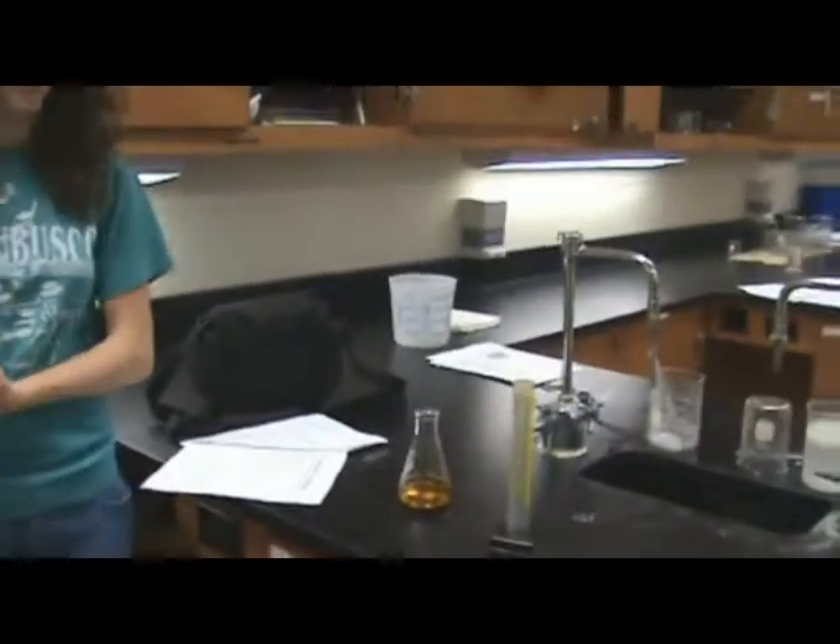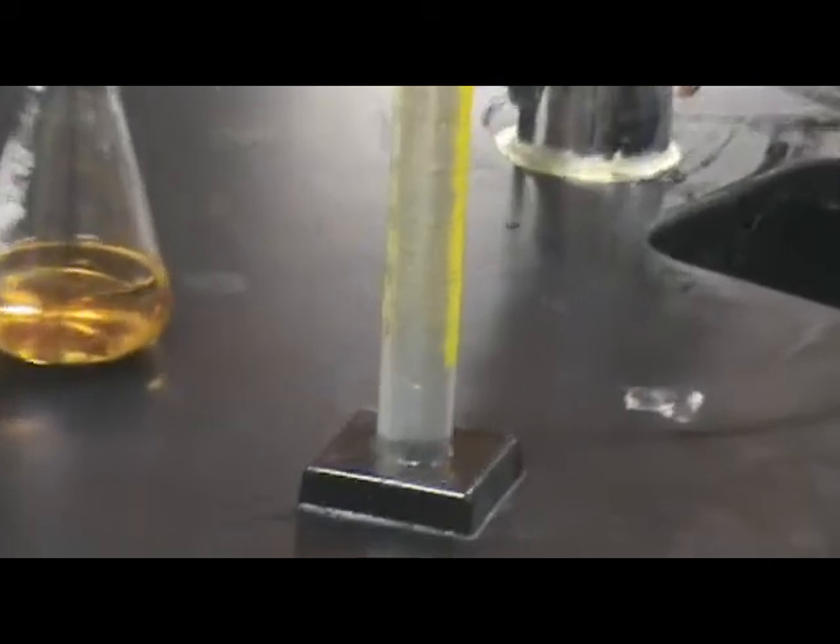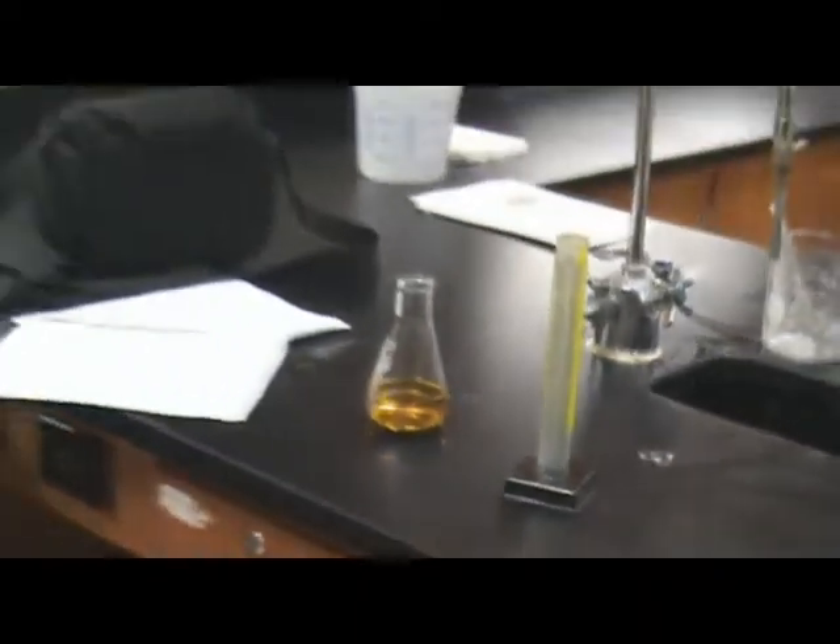This is called the Luminol Chemiluminescence Firefly Reaction. In here I have a solution of Luminol with NaOH. And here is bleach and water with a 1 to 10 ratio — 10 milliliters of bleach and 100 ml of water.